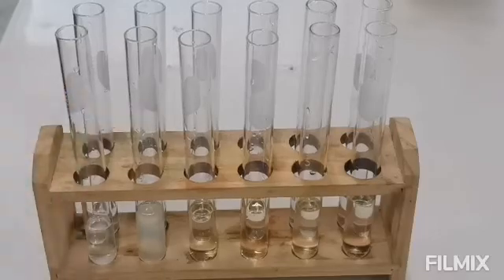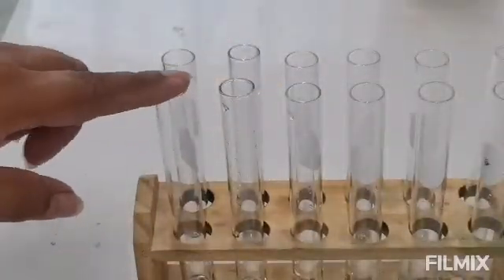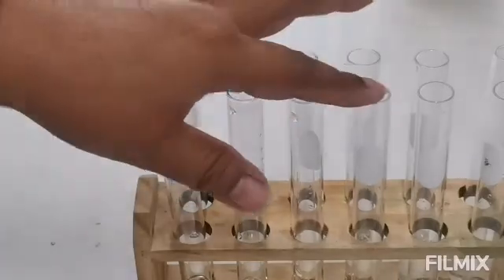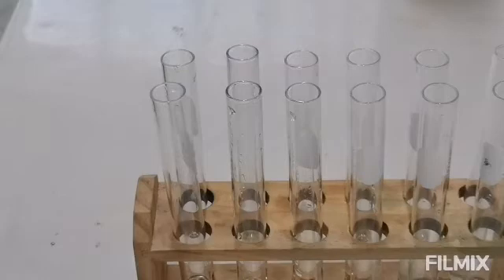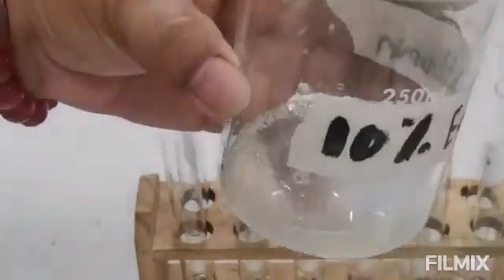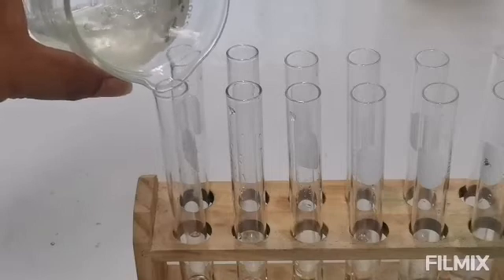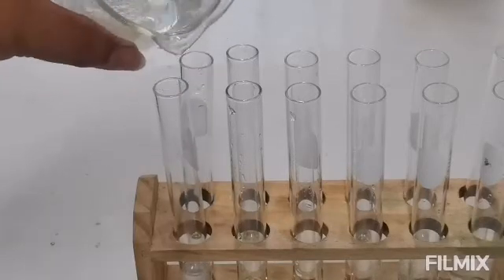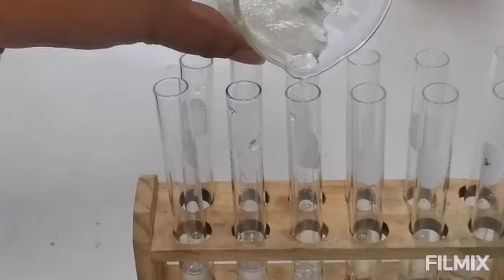Okay, let us do the same with your egg albumin. So this one is your sodium hydroxide. This second test tube here will be your sodium hydrogen carbonate. This is your citric acid. This is your ethyl alcohol, and then silver nitrate. Okay. So I am now adding your 10% egg albumin or egg white. Try to take note of the possible change in color.